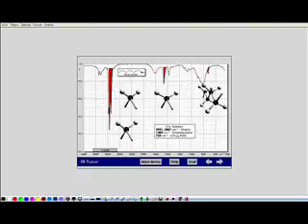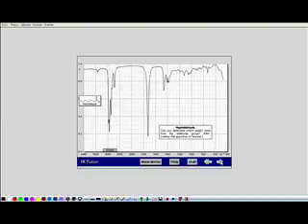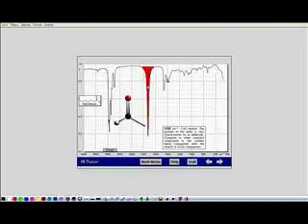Okay, what I think is the last group, carbonyls. The C=O double bond has a very characteristic stretch. It occurs between 1600 and 1800 wave numbers is where carbonyls show up. Now, there's all sorts of carbonyl functional groups. There are aldehydes, ketones, carboxylic acids. There are literally books that have tables as to what peak frequency corresponds to what functional group, whether aldehydes show up in this narrow region and ketones show up in this narrow region. All we're going to do is say if you see a strong peak from 1600 to 1800, that indicates that there's a carbonyl present. So it won't tell us whether it's an aldehyde, it won't tell us whether it's a ketone, it'll just tell us there's a carbonyl present. And that's all we need to know.